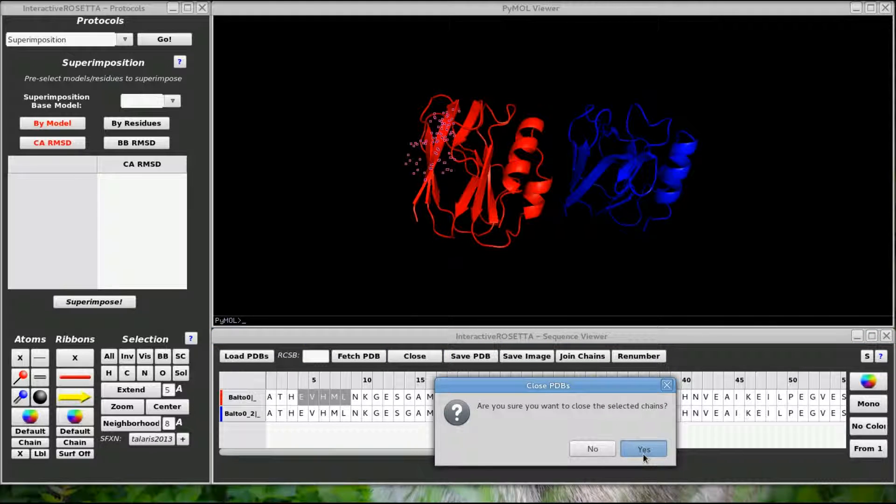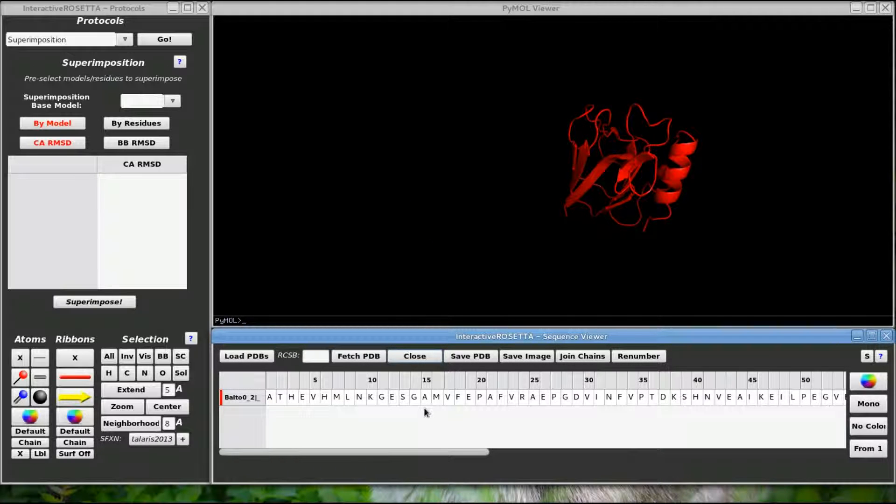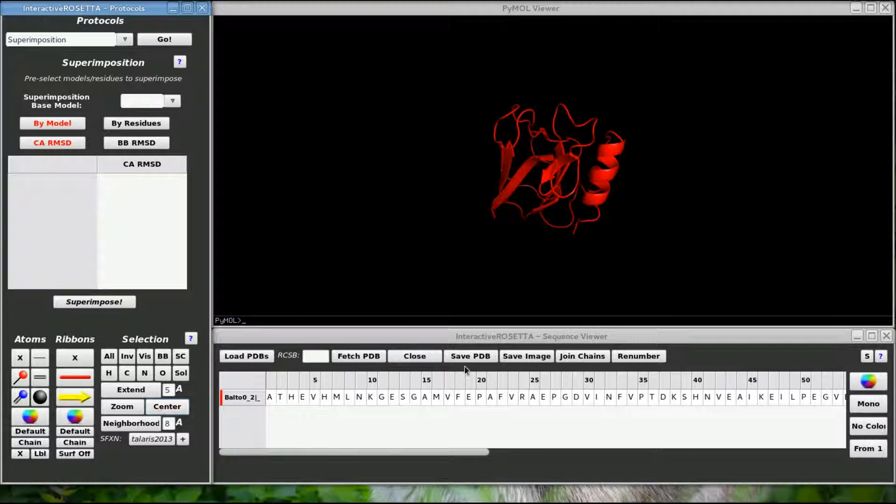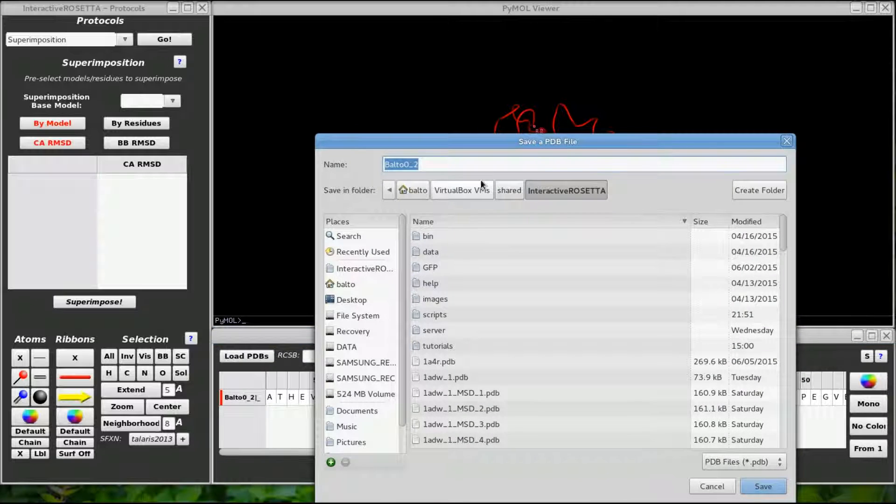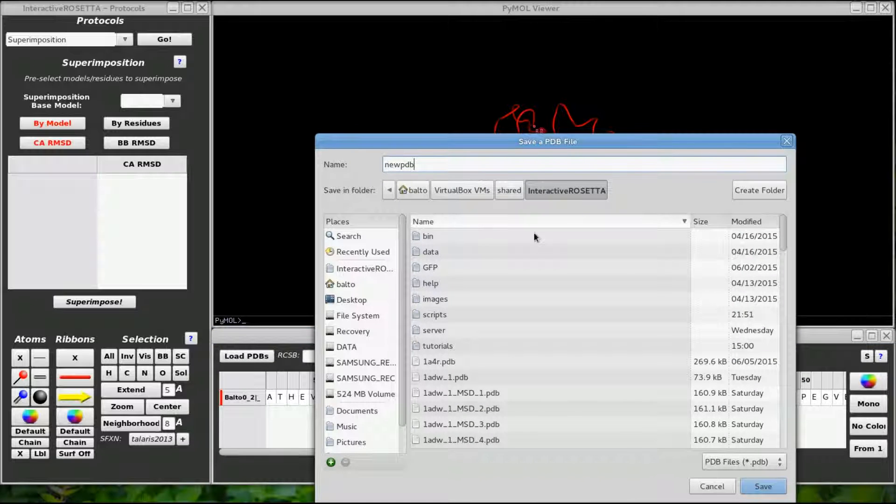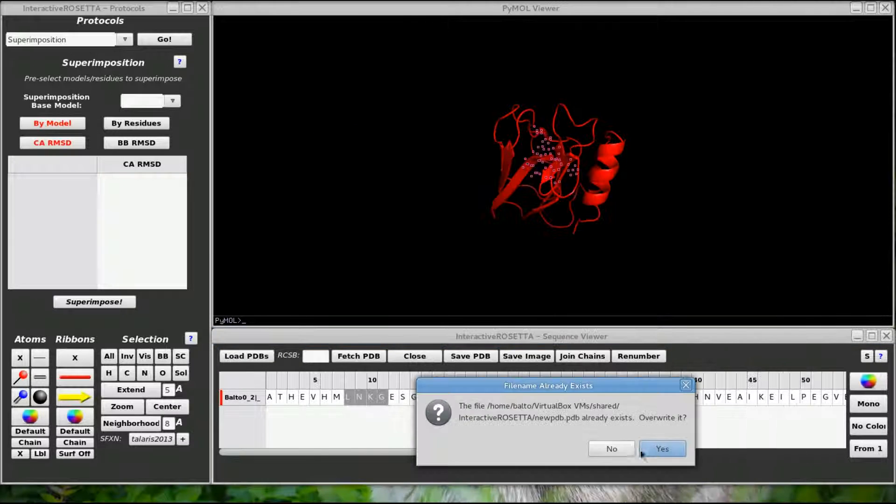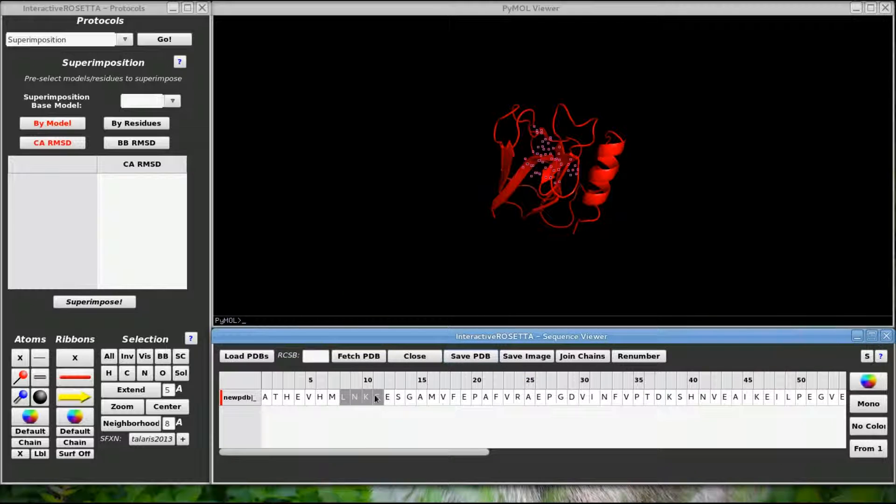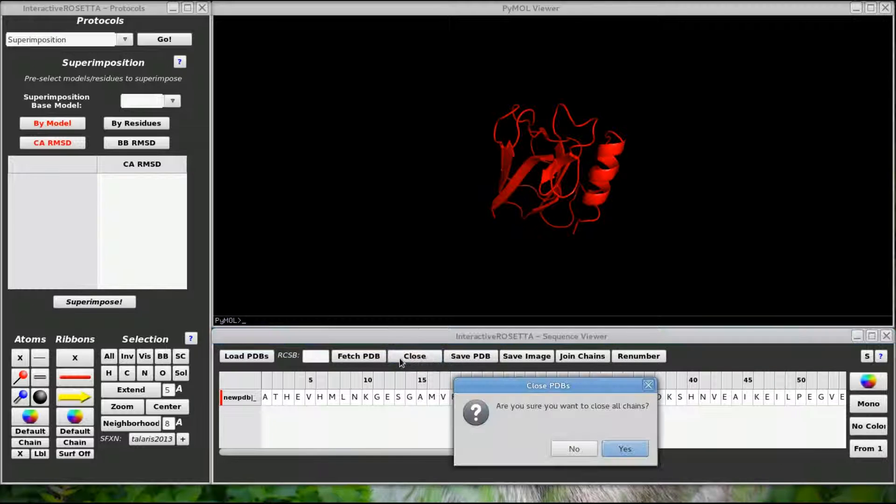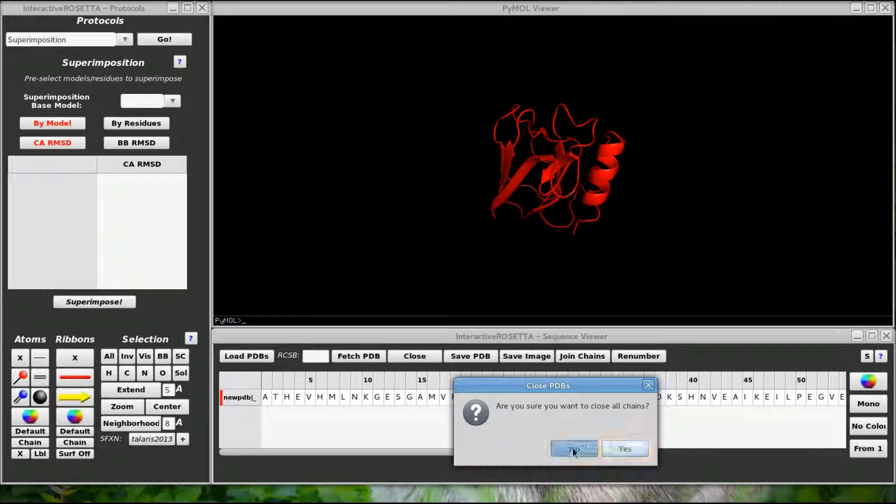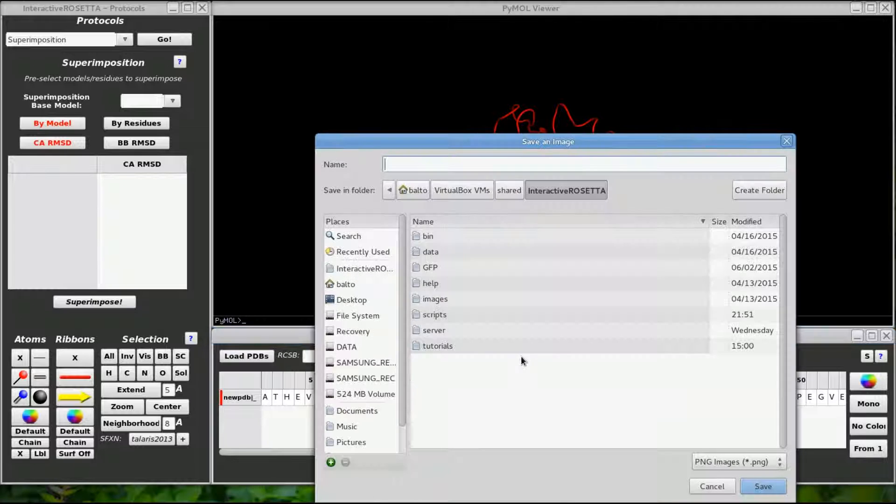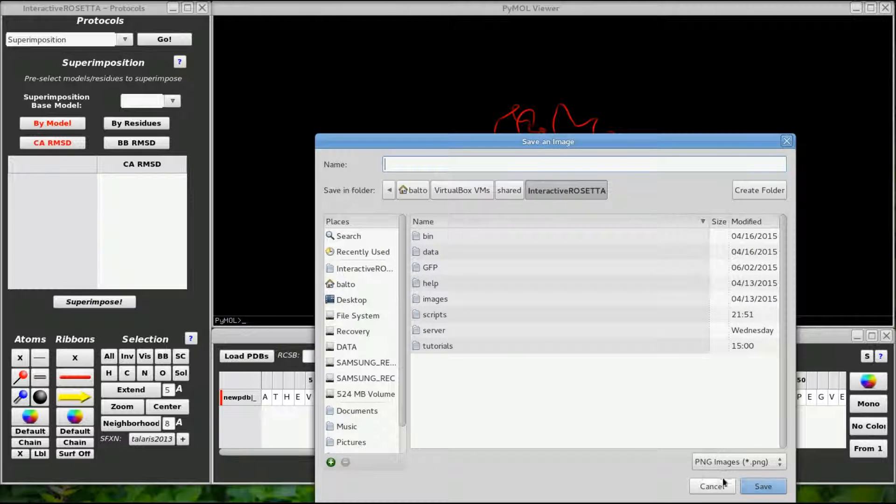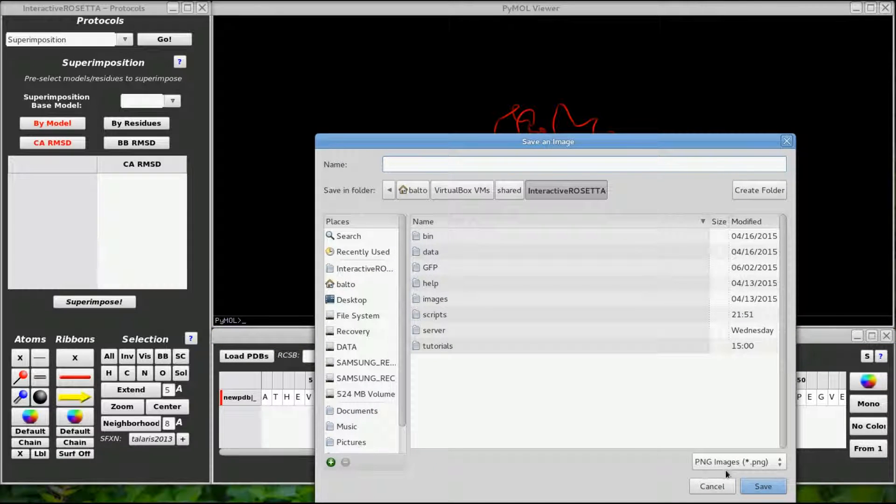Yes, I am sure I want to close it. Now I can save the second model by highlighting part of its sequence. Here it wants a file name for the structure, so let's give it a new name. If you did not have anything selected, close and save assume you want to close or save everything.